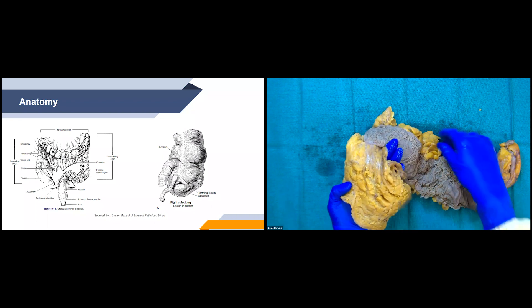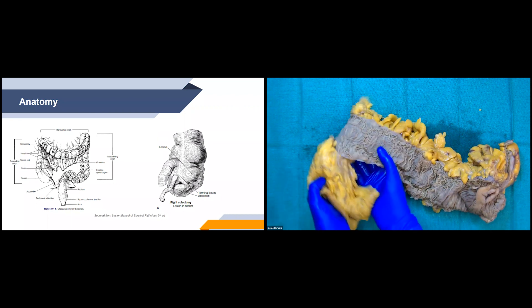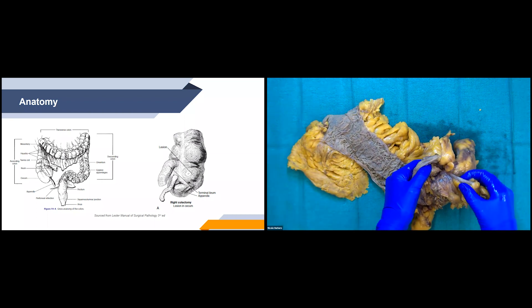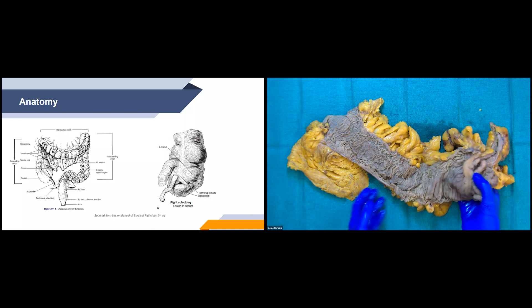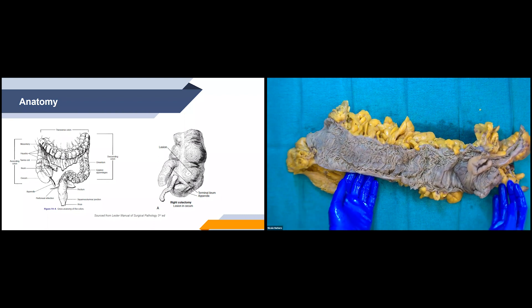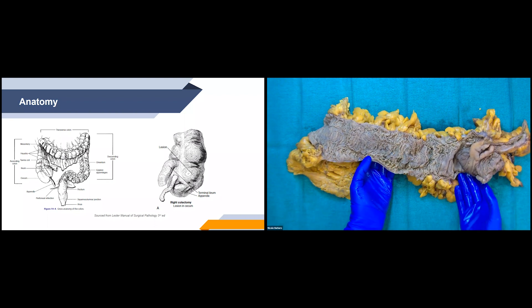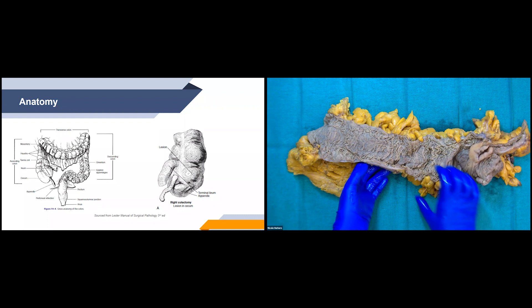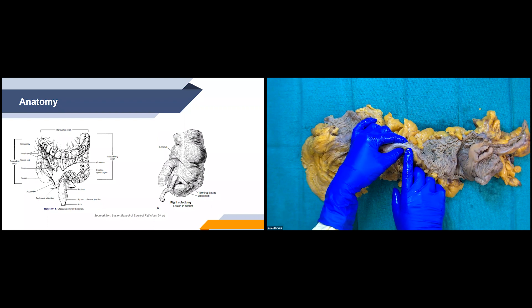This fat looks a little bit different than this fat here — this is the omental fat. I also have an appendix here, which comes off of the cecum. A few other distinguishing factors that I know I have a portion of large bowel is that the large bowel has what's called tenia coli. That's three bands of longitudinal smooth muscle, and you can see that right here, which is kind of where I made my cut through the specimen.